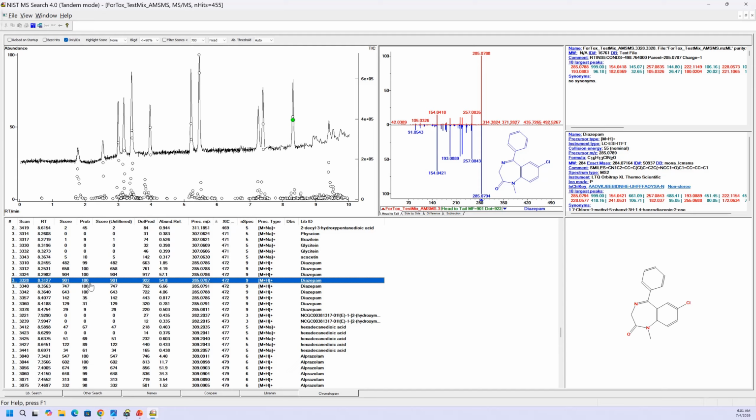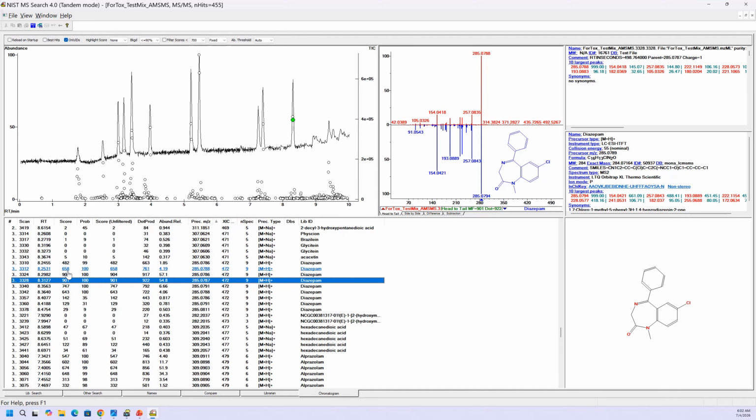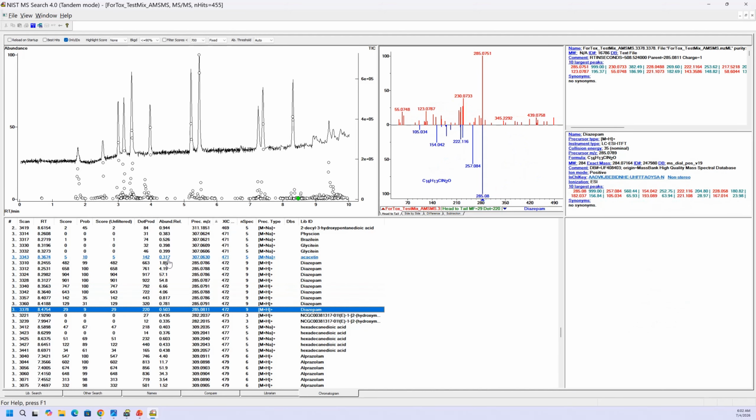You can see some of them have pretty bad scores if you look at them. So click on the first one. I'm using the keypad and using the arrows. You can see I had a fit of about 900 for that, 901. They go down to as poor as 29. It grouped it because it thought the precursor accurate mass was good within the range, and it thought the isotope ratios for the ions it saw were good. But you can see it's a somewhat noisy spectrum, and that's why they picked the best hit, because it's better results that way.